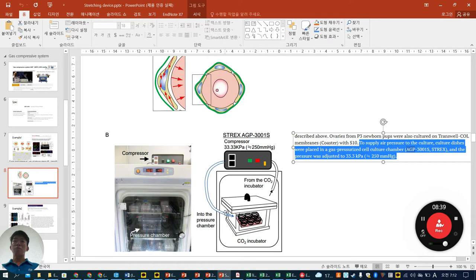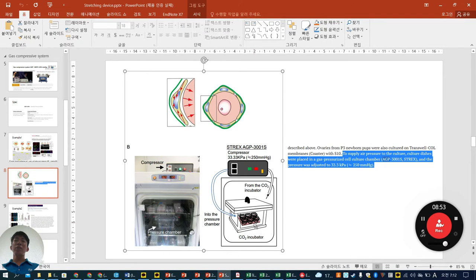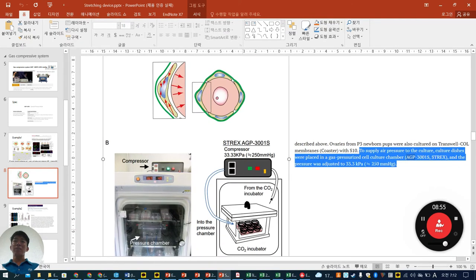계속 되죠. 좀 빠지면 더 넣고 하는 것 같아요. 그걸 이제 여기서 센싱 한다. 가스를 눌러가지고 물의 압력을 누르는 거지. 그렇죠, 예. So originally the pressure origin is from the gas. So when this chamber gas pressure is higher, and then from the gas and media and cell, like this pathway, cell can be influenced.